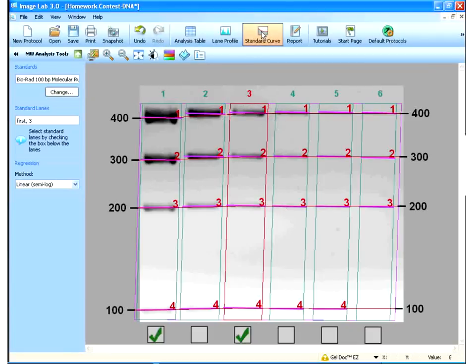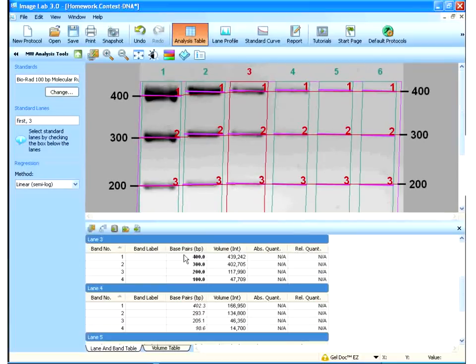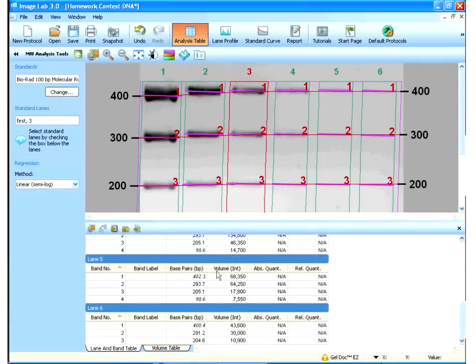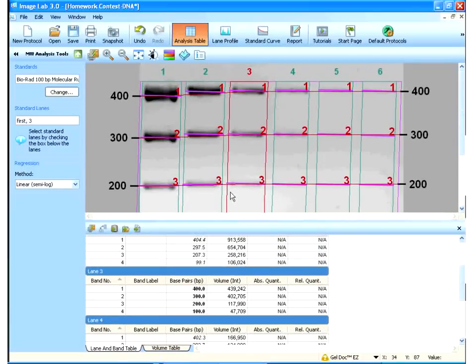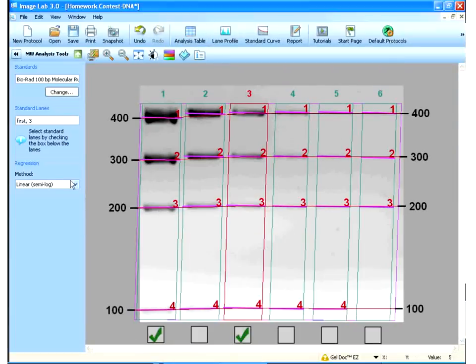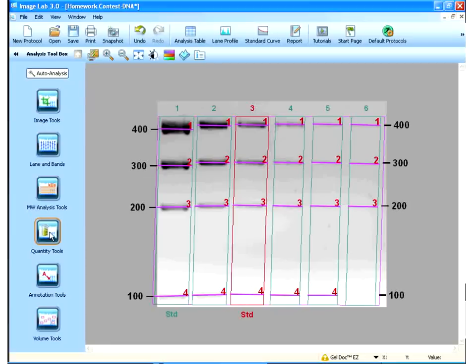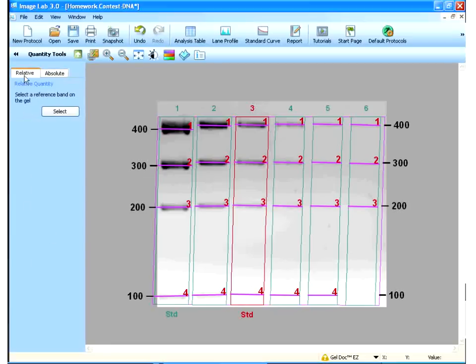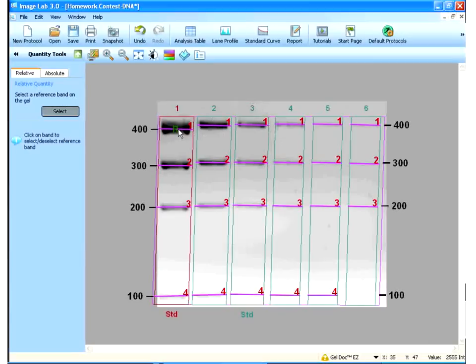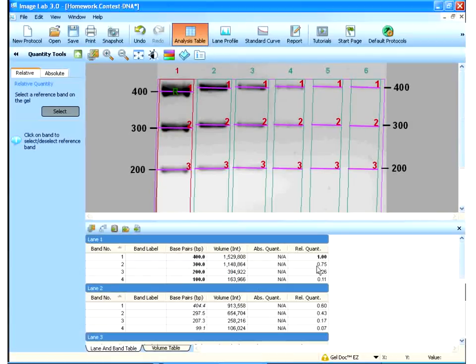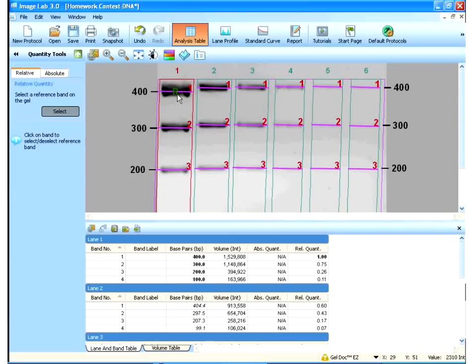And, then, if I click on the analysis table, now I have molecular weights for everything. For all my lanes and all my bands. So, that's done. Next step is quantity tools. So, I can do relative quantity. So, if I want to do the density of all my bands relative to this one, I can say, okay, select my reference band. There's my reference band. And, now, if I go to the analysis table, all the densities are relative. So, this band is 0.75. Band 2 in lane 1 is 0.75 of this. And, this one is a quarter of this density. And, so forth. For all the lanes, it used that one reference band.